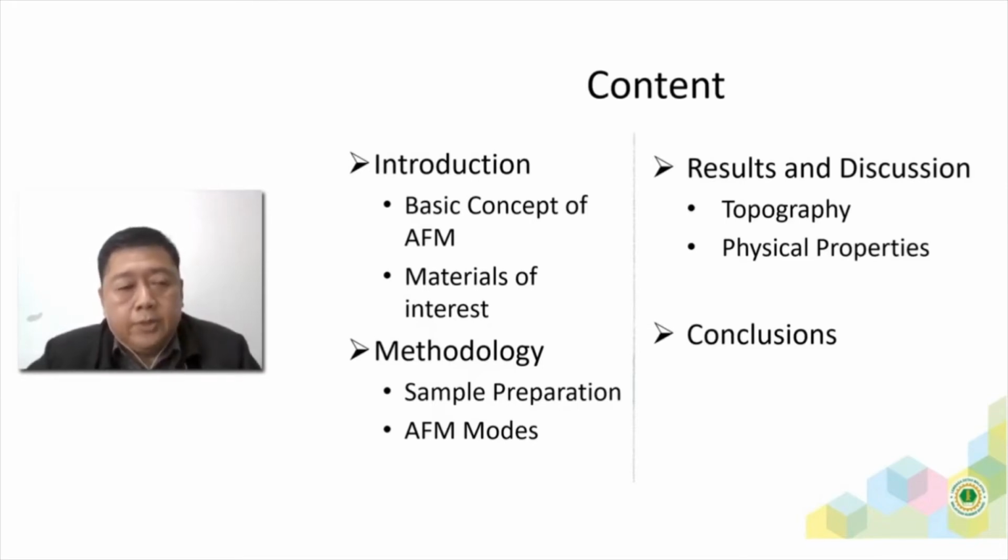One of the samples is actually not from us, but from the industry. There are some AFM modes that we use in the studies. Mainly it's for topography, but we also do some mechanical property testing. And for one of them, we used conductive material in our samples, so we use the electrical modes. After that, of course, I will share with you some of the results, covering the topography of the samples that we analyze, and some of the physical properties.